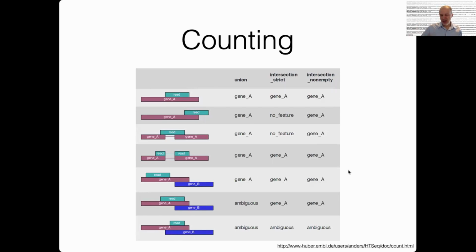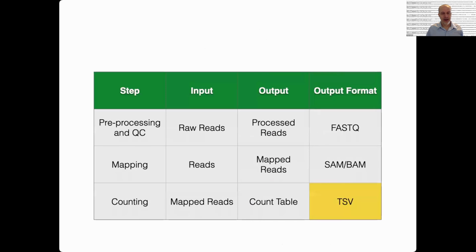There are different ways of handling this. We're not going to get into details, but it's useful to keep this in mind because every once in a while, this will show up and it will be an important problem. I had a data set where a bunch of reads were getting thrown away because they were like this. And so there was no data from a given gene that collaborators said, oh, well, we expect this gene to be expressed at a really high level. So it's a helpful note. Most of the time you don't have to worry. But every once in a while you do.